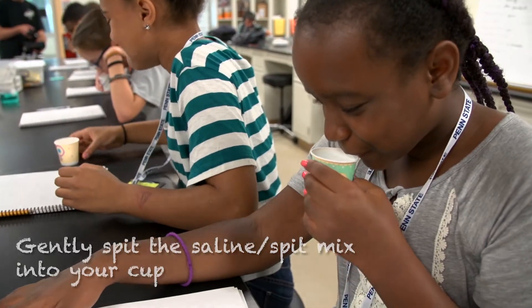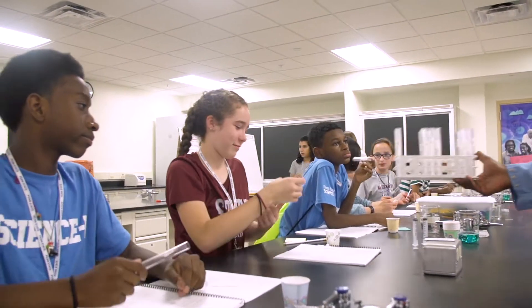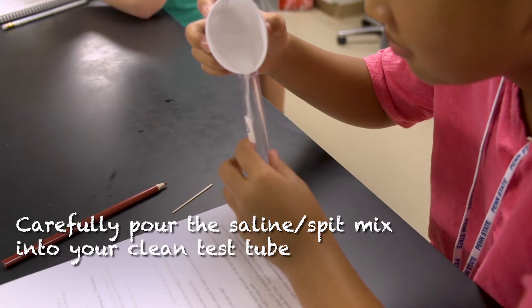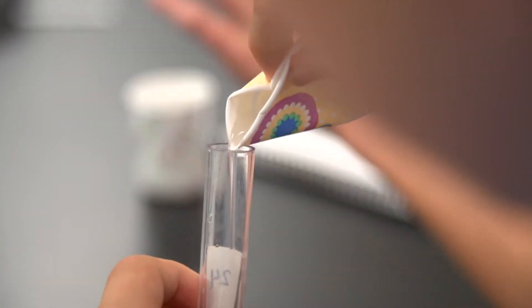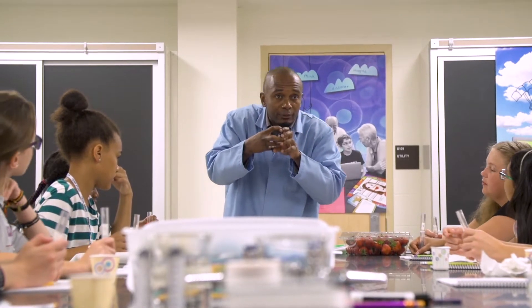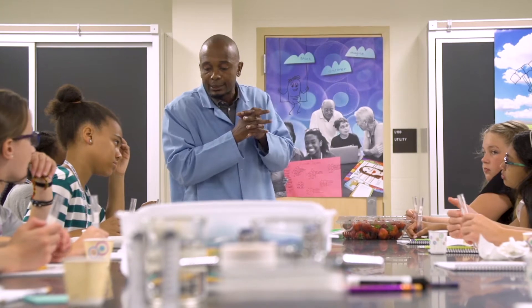Really, the better you do it, the more cheek cells you get. Write your number down, carefully pour it in the tube and hold it. When you have something negative, what do you need to really make this stuff visible? You have to bind to something positive. So basically the salt is going to bind to the DNA so that we can see it — to allow us to visualize it a little bit later.